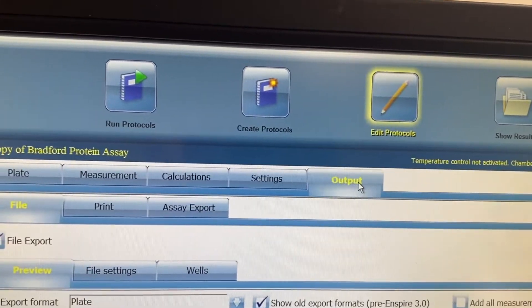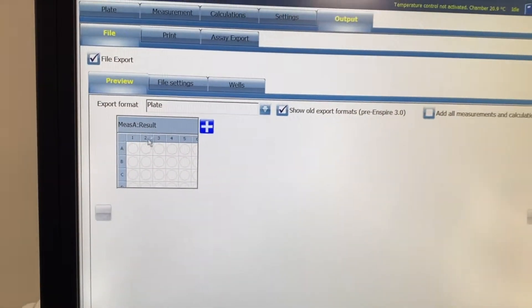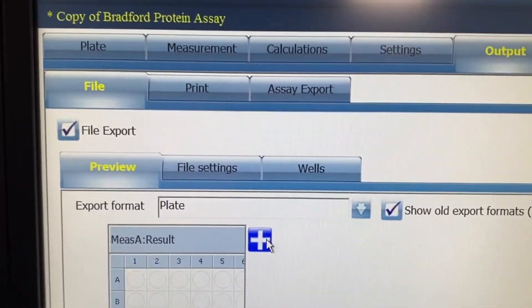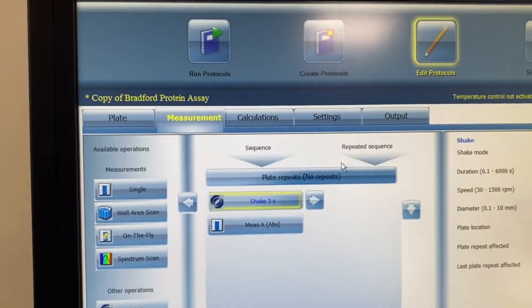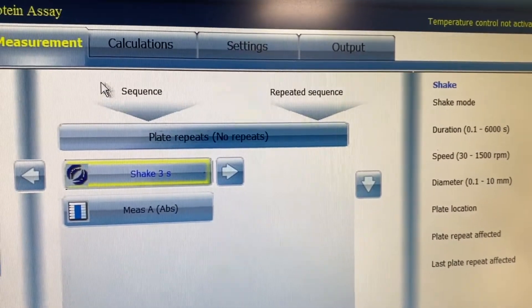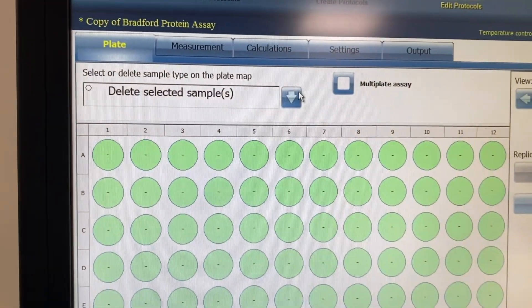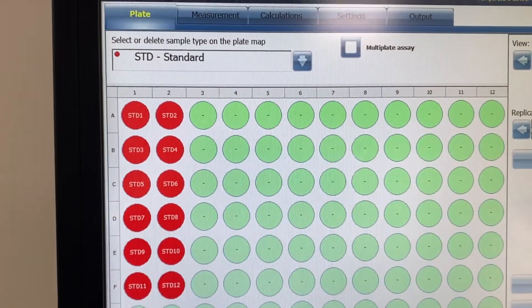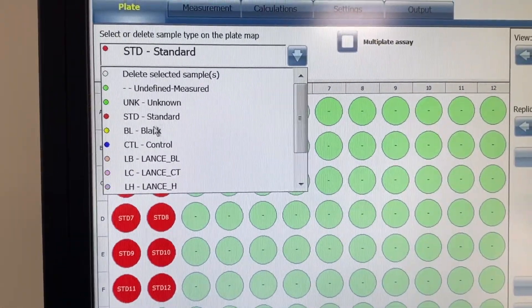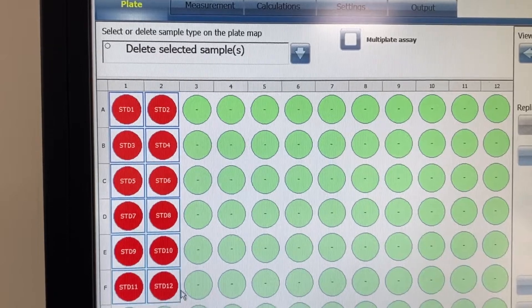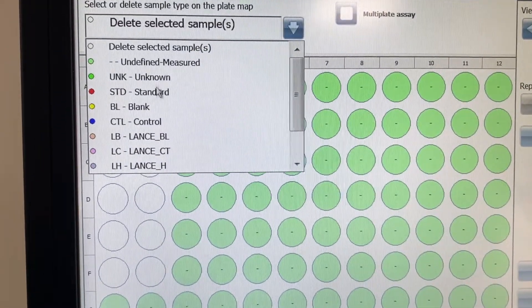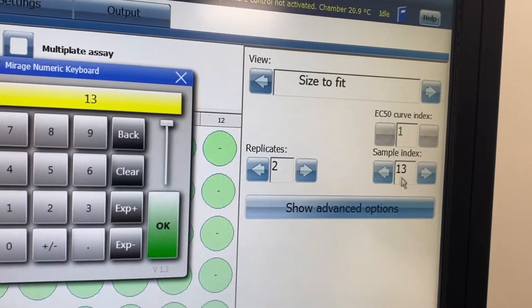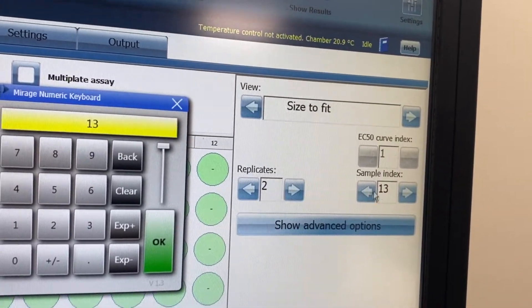You've also got your outputs. There's an initial plate measurement it will put out, but if you also want a standard curve for your measurement, go back to the plate layout. Certain wells are going to be your standards, so mark those as standards. Normally you do replicates — so instead of single kits, acknowledge that you want replicates. This is where you can change your replicates.